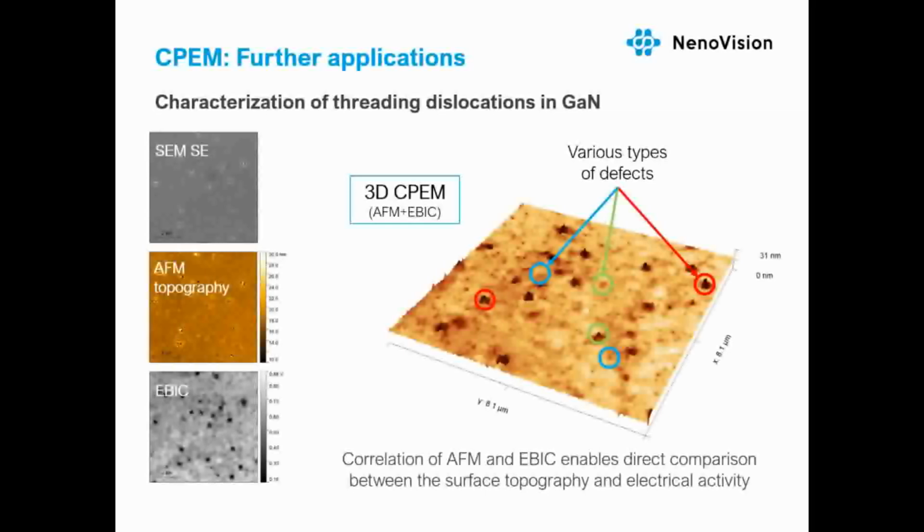These recorded values provided three maps that allowed correlation of topography changes with the electrically active surface around them, which is the negative electron beam-induced current contrast, and also with SEM-SE intensity.